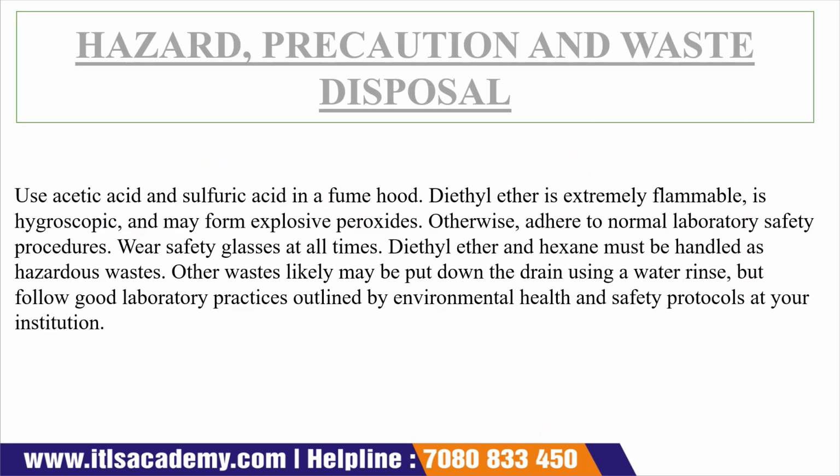Now the next one is hazard precaution and waste disposal. We all know that we are using two acids, one is sulfuric acid and one is acetic acid. So these acids should be used in a fume hood, and we all know that diethyl ether is flammable in nature. So we have to avoid opening it around a flame.